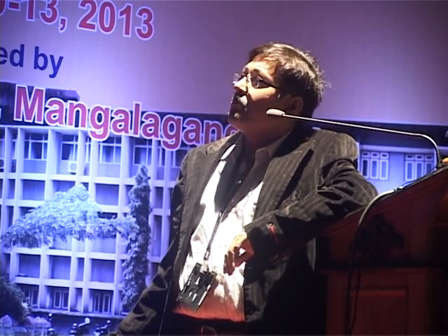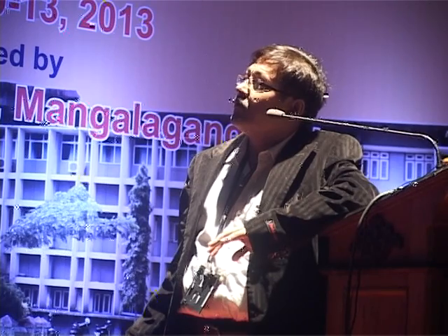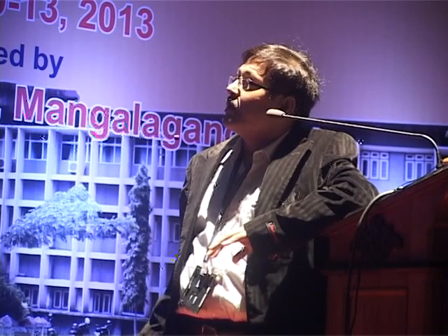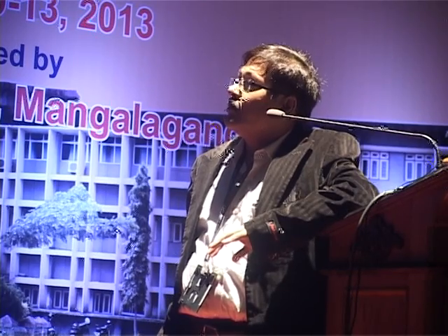Here you can see we collected 20 liters. Proper marking has been done. After marking, because transport is not available to the sample site, we have to take help, and these people bring the water from the deep bedrock to the nearest road, where the sample can be loaded on a wagon, and then we bring it to the lab. Then we process the sample, and alpha counting has been done.